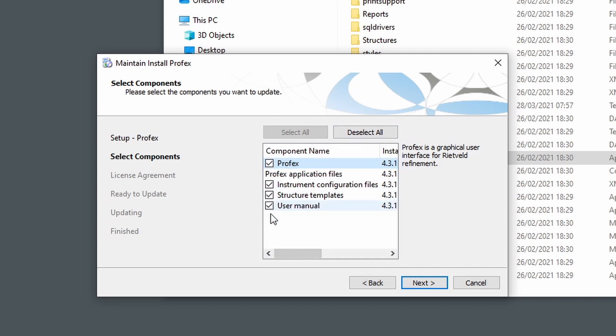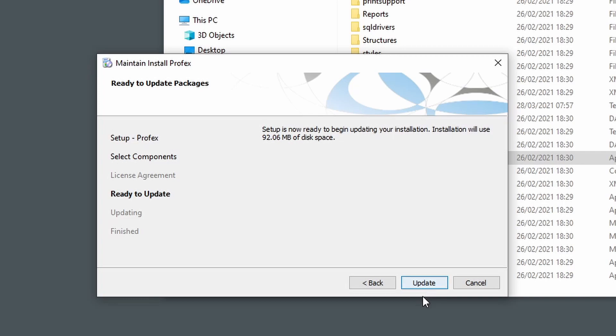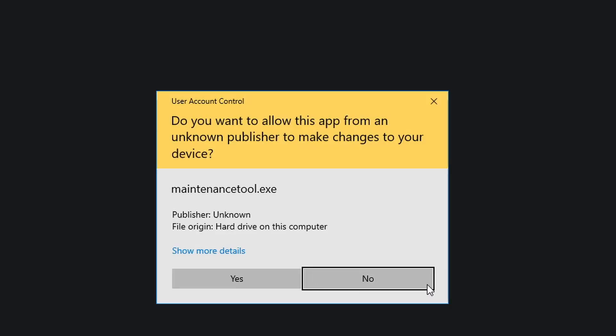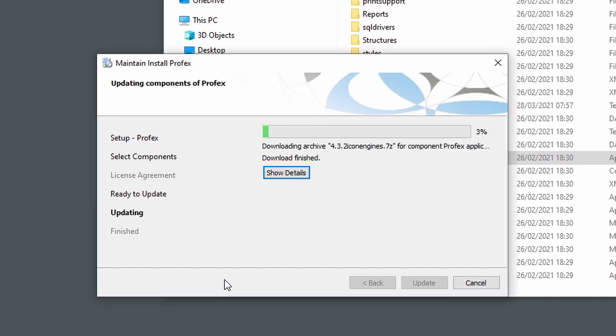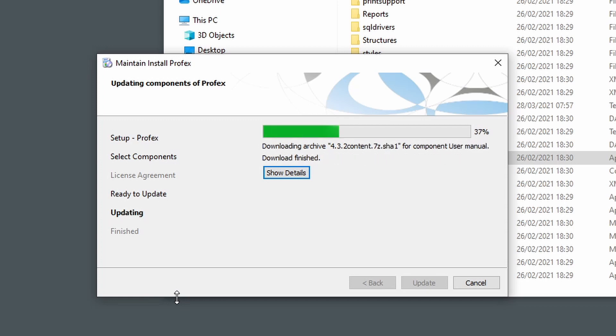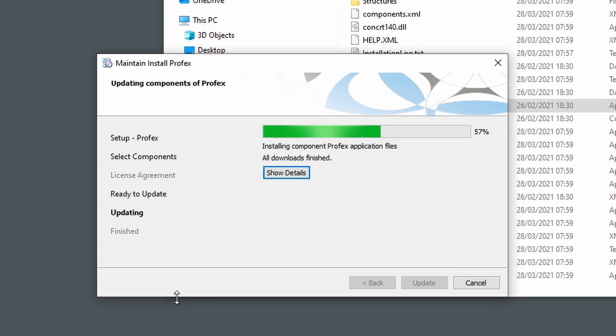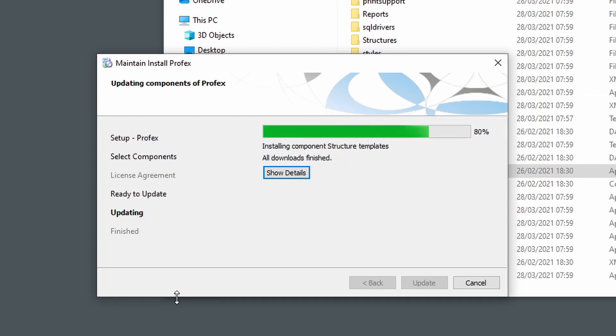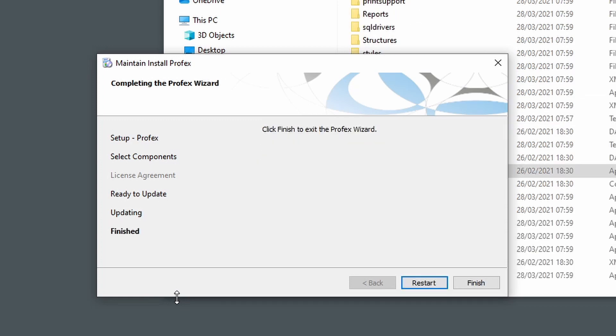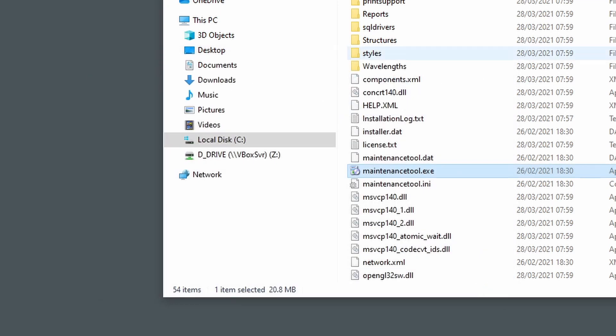We select all of them, click Next, and then click Update, and now it will download the new components and install them. Then we can click Finish, we don't need to click Restart, just Finish.